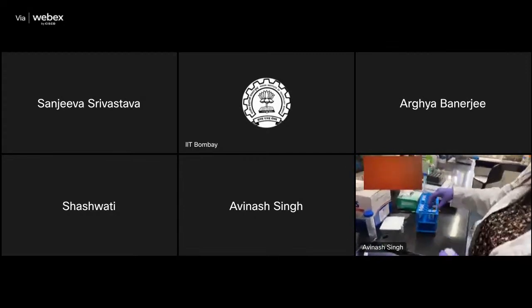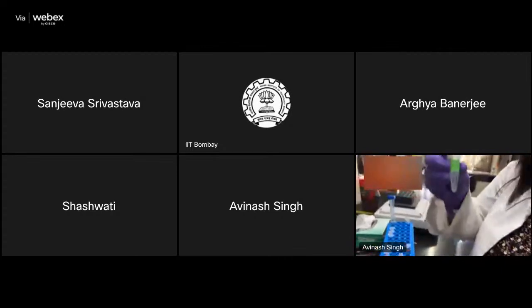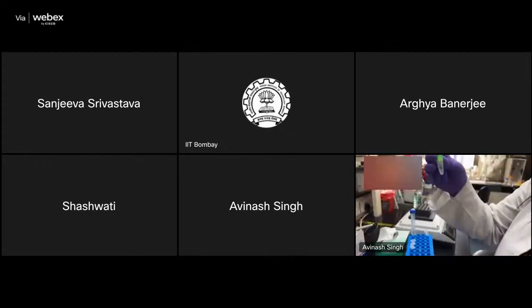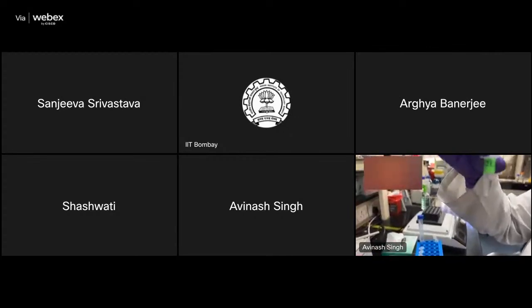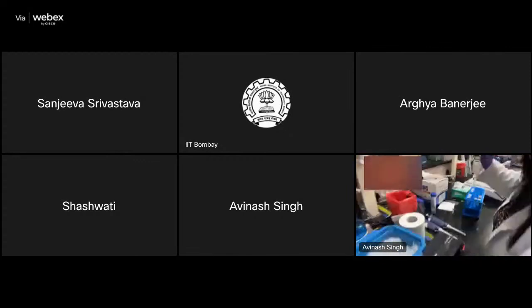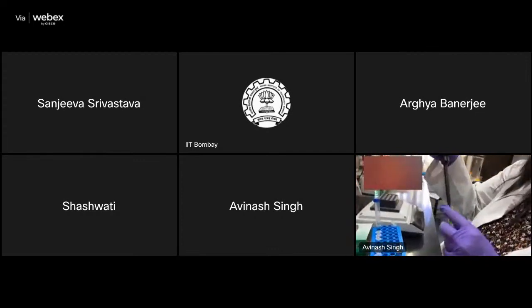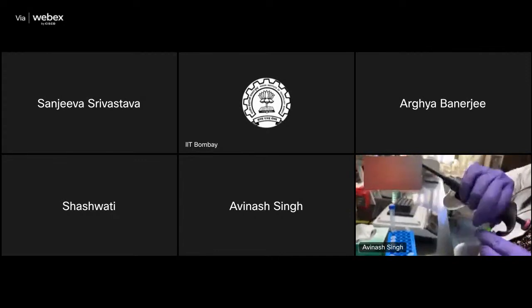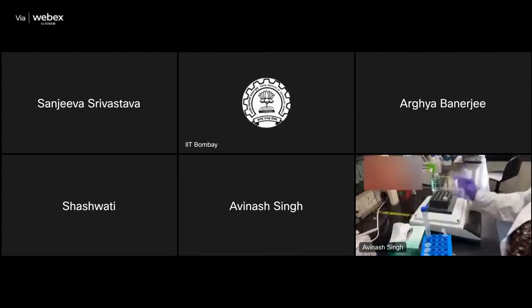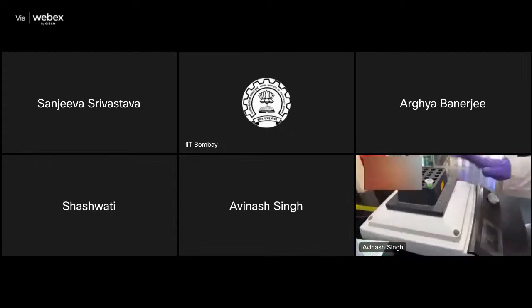Now we are first going to add a reducing agent. Here, the reducing agent is important for reducing the disulfide bonds that are present inside the proteins and in between the proteins. So we are using TCEP, tris carboxyethyl phosphine. It will break the disulfide bonds. So we will first add the TCEP, and then we will incubate the samples for 1 hour at 37 degrees centigrade so that the digestion is proper and complete. We will incubate the sample in this incubated shaker chamber for 1 hour.